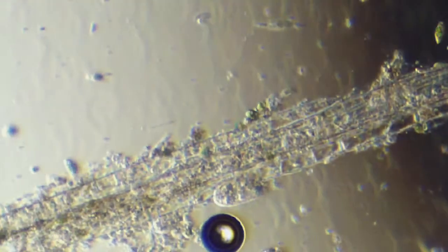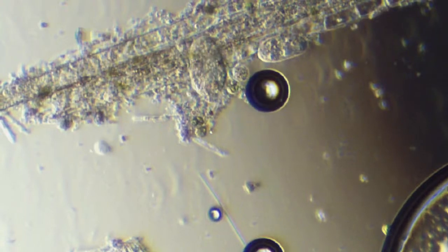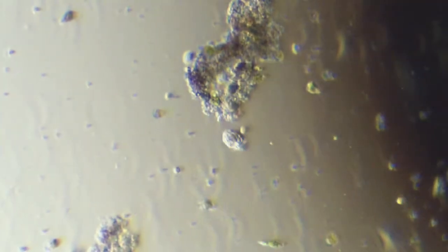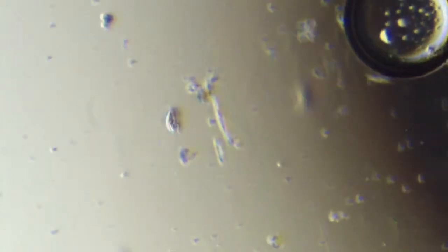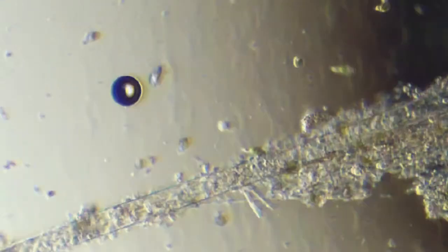Check out some other area. Another one that looks like a Euplotes there, the way it's moving. It's got the cirri, it's got that crazy thing in it, and you can see it's concave on one side. They actually walk like beetles on things. It's pretty cool. I love these little guys. Very fast at times, though. You gotta wait till they slow down and check out an object and crawl over it. So pretty good off the bat.